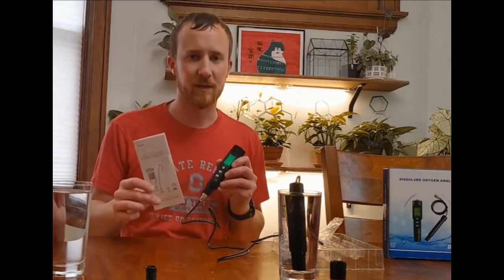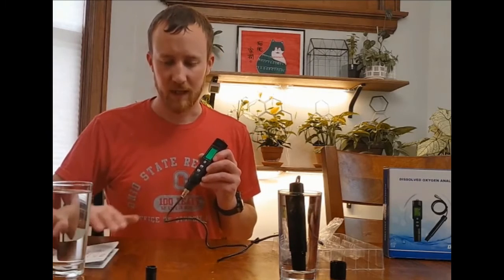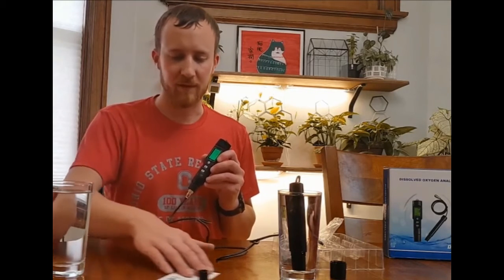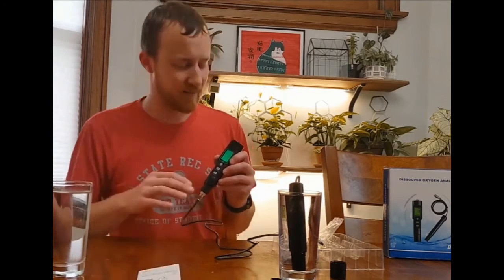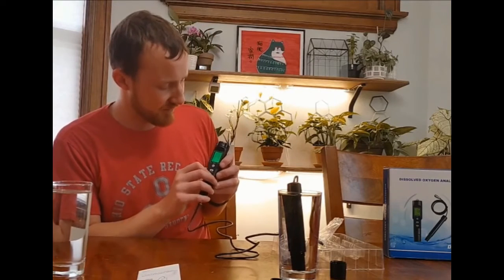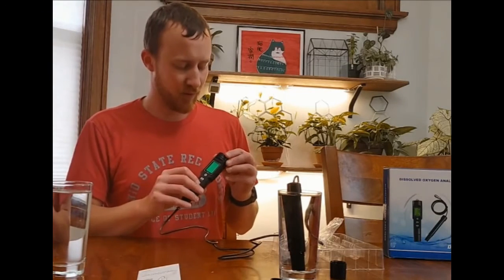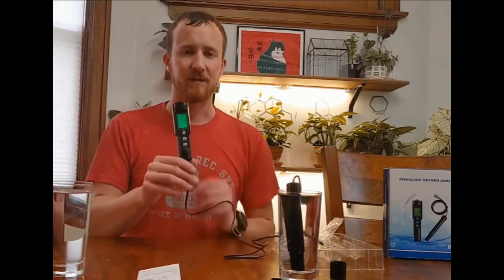The instructions do tell you to calibrate it, so if there's something more than I know where it needs to be calibrated every time, we'll get to that. This is straight out of the package.